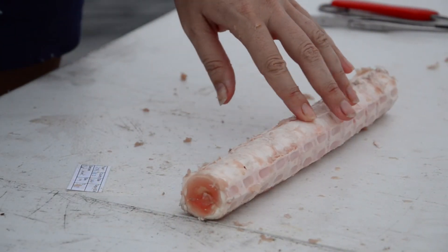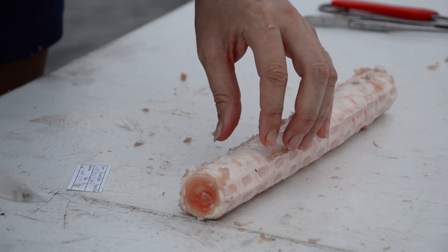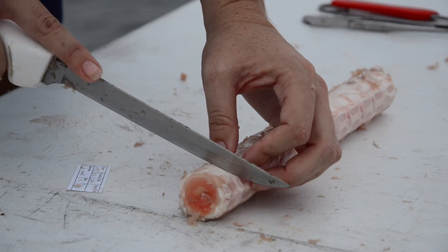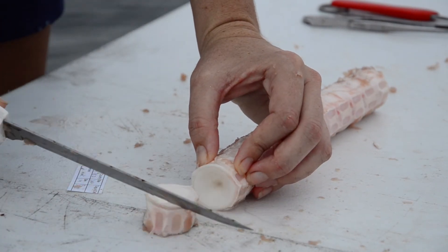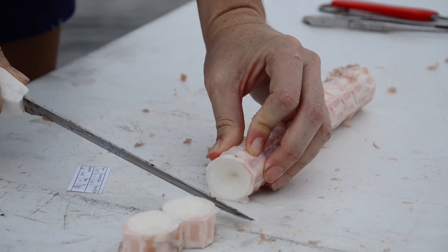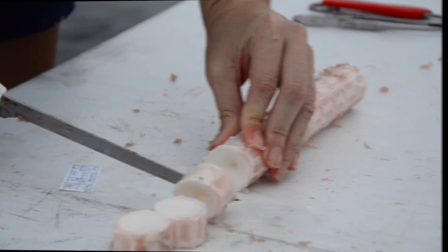Our log is mostly clean and I'm going to start separating the individual centra. You can tell when you're in the right spot because the knife will go straight through, and you can actually feel with your finger where the separation is. So I'll continue along until I have all my individual shark vertebrae separated.